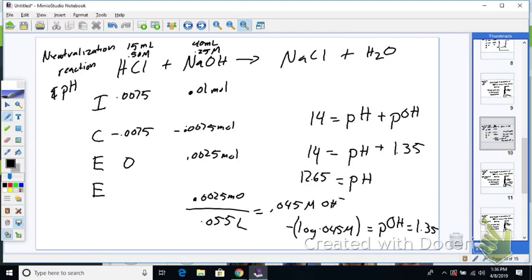You guys that have the pH probe hooked in, there it is. Look at its tip. You need to go to the sensor, and the sensor should show pH probe. Do you go down to calibrate? So go down to calibrate, and then hit pH, and it should say calibrate now. So you hit calibrate now.